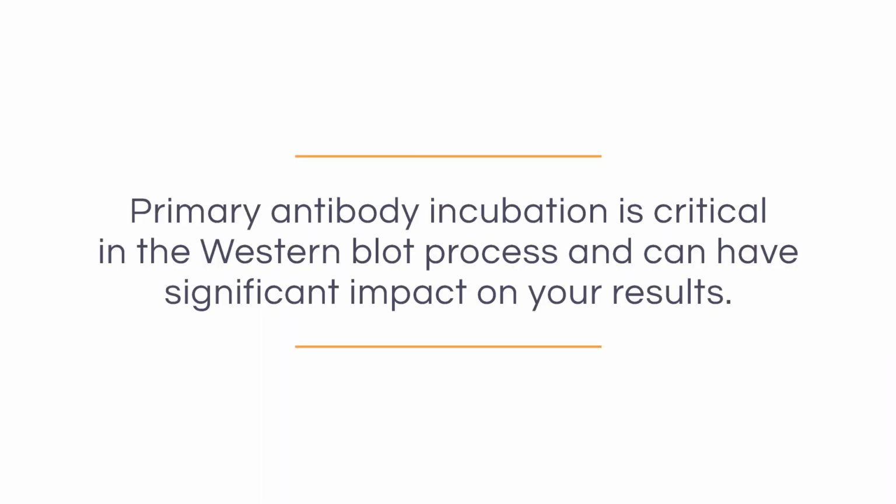In the previous course, we talked about blocking the membrane. This prevents nonspecific primary and secondary antibody binding. After the membrane is blocked, we are now ready to proceed with the primary antibody incubation step. Primary antibody incubation is critical in the Western blot process and can have significant impact on your results.